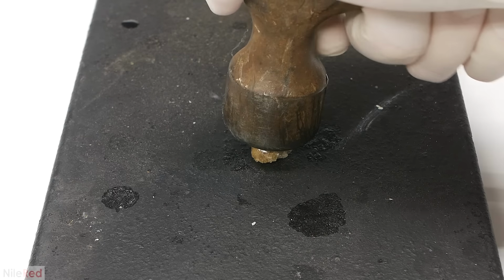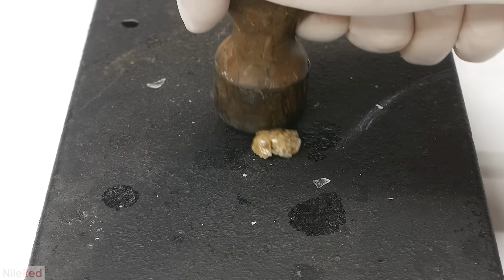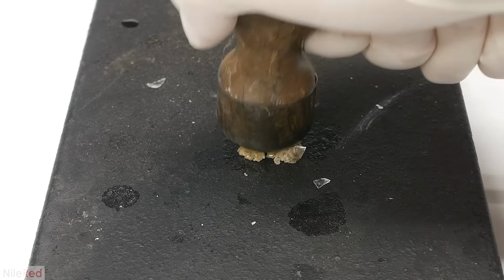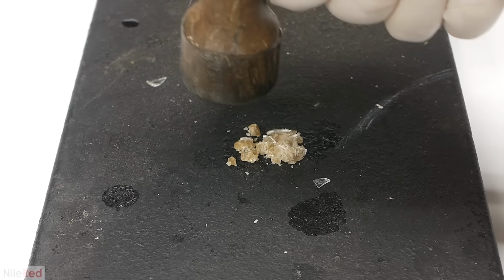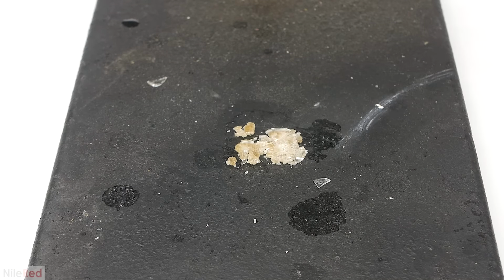I went to do another hammer test, but smashing it this time doesn't really make any sense, so I just squished it. These two runs didn't exactly give me the highest quality cellulose acetate, but they did highlight how important the plasticizer is. With not enough, we get a plastic that's too brittle, and with too much, we get one that's soft and not very durable.